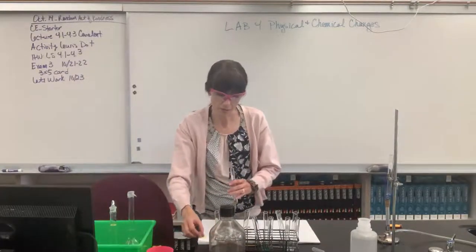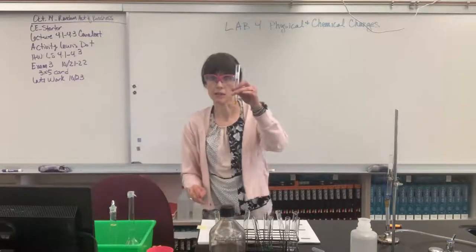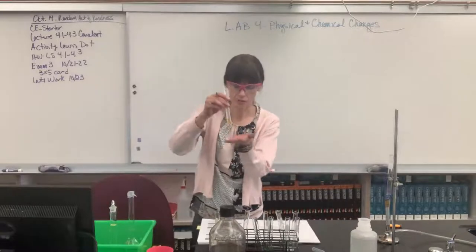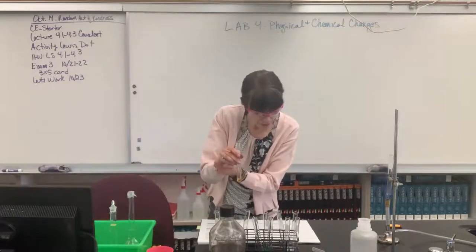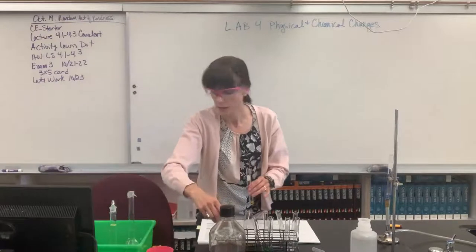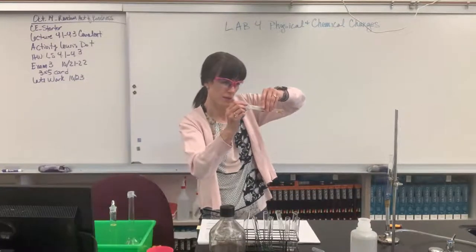So we are going to be now on page 54. And the color of this solution is yellow. So let's write down yellow. And now I'm going to come back to my part C. I did my 30 drops, we dissolved it. Now it says put 10 drops of the solution prepared in step two into each of two other test tubes. So I got two other empty test tubes prepared for us. Here they are. And I'm going to get another pipette, a clean pipette. We're going to do 10 drops into each of these other test tubes.